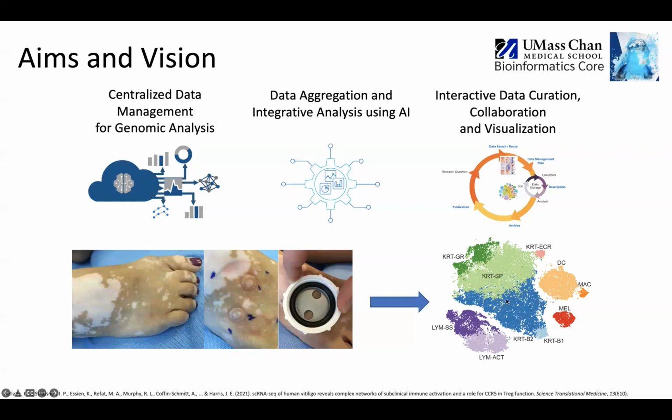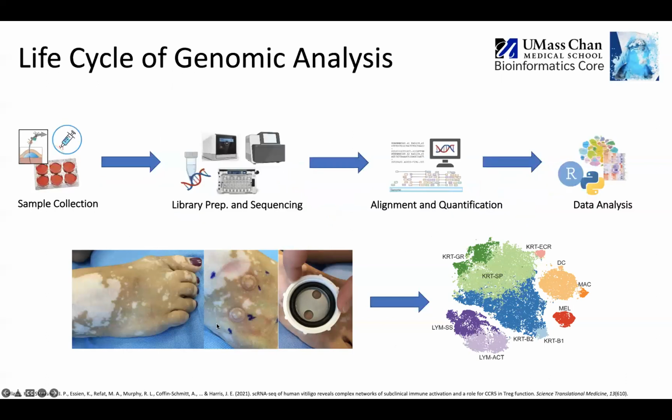At the end, what you're going to get in this case, for example, is this kind of t-SNE plot coming from that patient, or in this case, 170 patients' data in a single t-SNE plot here, characterizing all the cell types coming from there. And then we can answer lots of biological questions when you have the metadata attached to your processed data. This is the real aim. We just want to create this kind of one unified environment, okay?